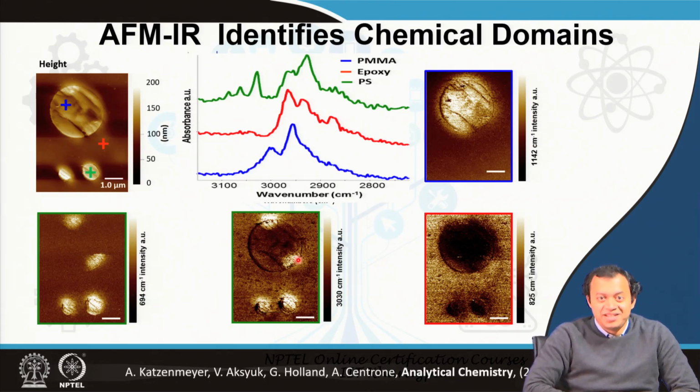Come on, you have to admit this is uber cool. Come on. Now think where we can establish this. The scale bar is 1 micrometer. So, these are like 500 nanometer in size or a little bit more, and you can see even internal structures.